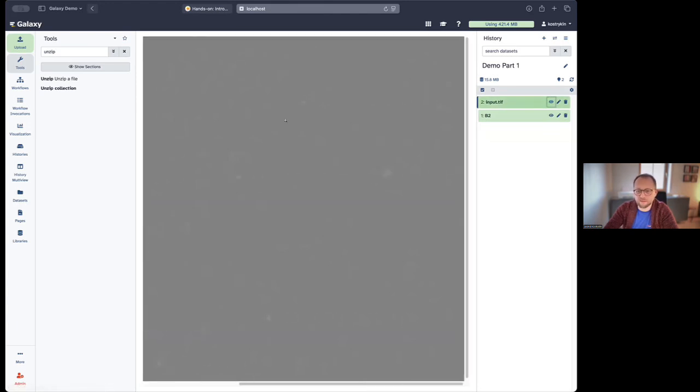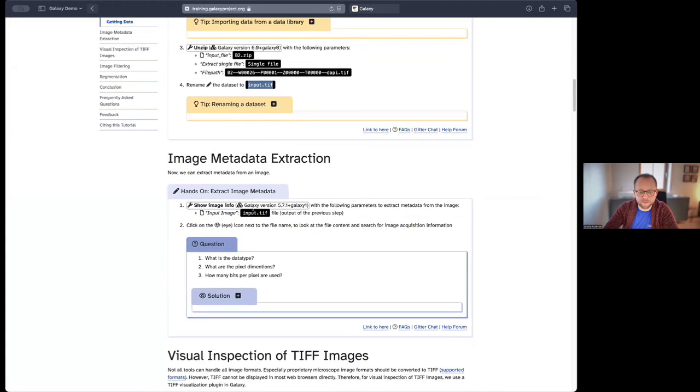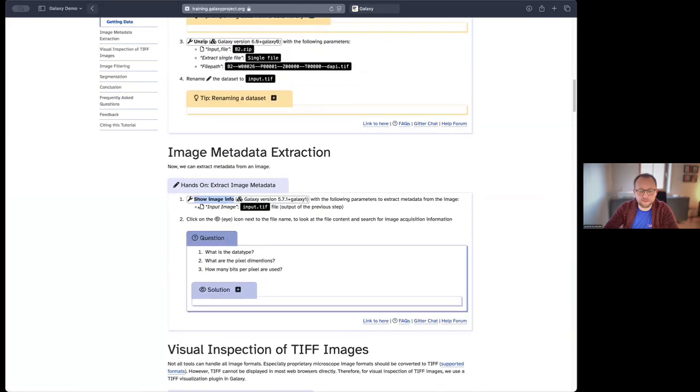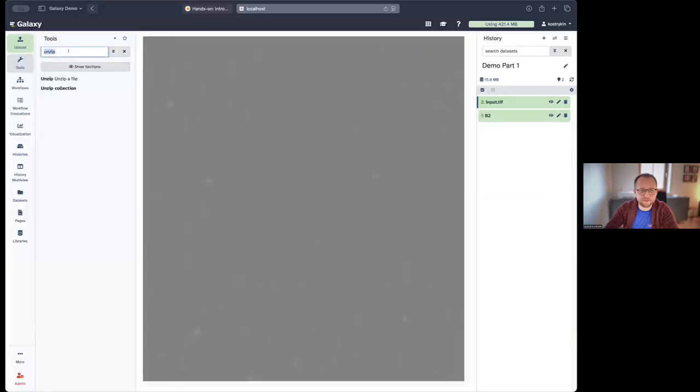And as you can see, it's hard to see what is actually contained in the image. So it's hard to see the cell nuclei here. This is due to the fact that the contrast of the image is just not that good. And this is why we will also improve the image contrast later on. But first, let's see how we can inspect the metadata of this image.